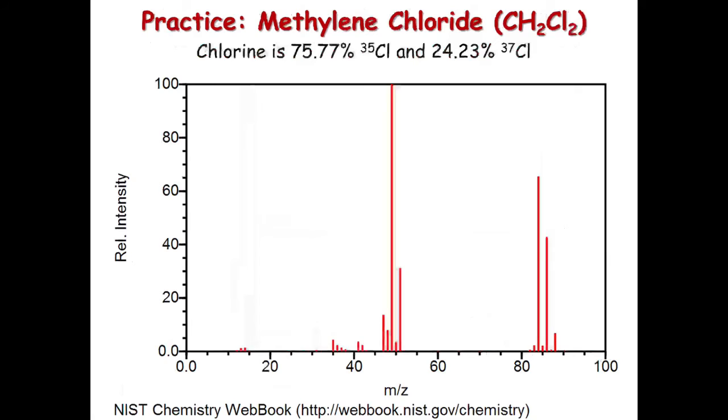Methylene chloride, as we see here, look at these yourself. You can see that we have a tall peak around 40, close to 50. And so that is actually probably going to be a fragment of CH2Cl. And then the ones around 80 to 90, you're looking at the methylene chloride still together. So most of this actually does break apart.